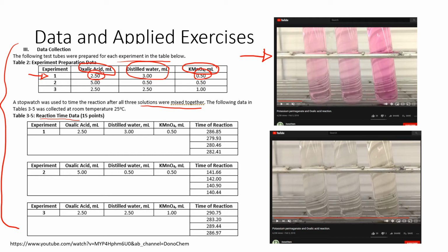By complete, we mean that for this particular reaction, you'll see a color change. It starts off purple, and you can see it there, and it turns into a dingy yellow, basically. And these screenshots right here are from a YouTube video. I linked this video in your lab handout in the objective, the introduction part. So you can take a look if you actually want to see this reaction happening. If we were in lab, you would be seeing it, but this is the next best thing.